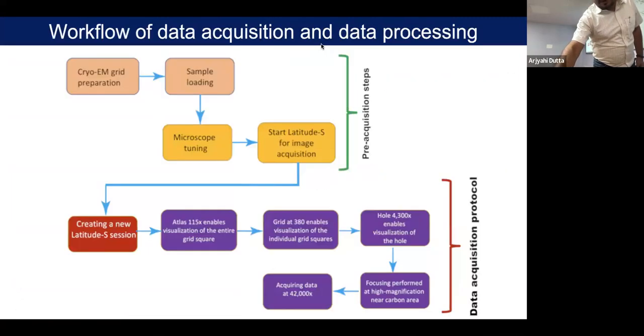Okay, we'll skip this part. At this moment this is not required. So I already discussed the cryo-EM grid preparation and sample loading. Now I'll talk about the imaging part, how we can image.